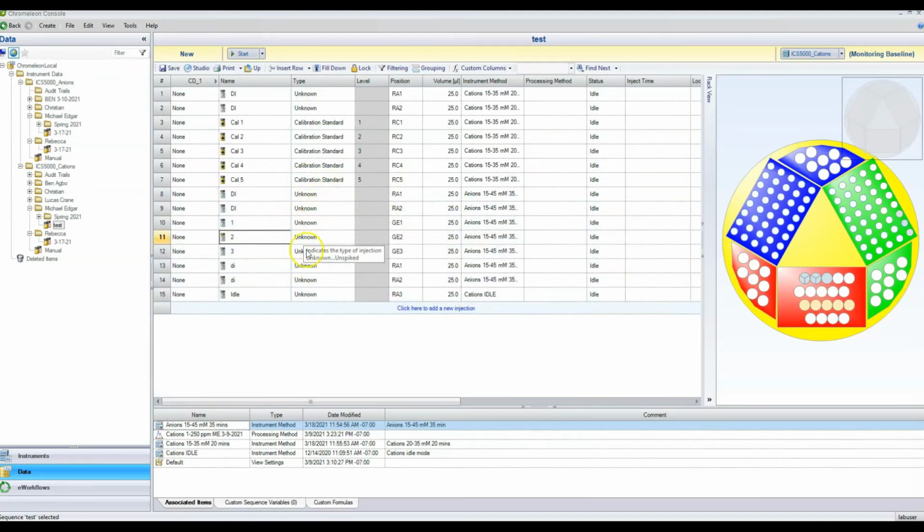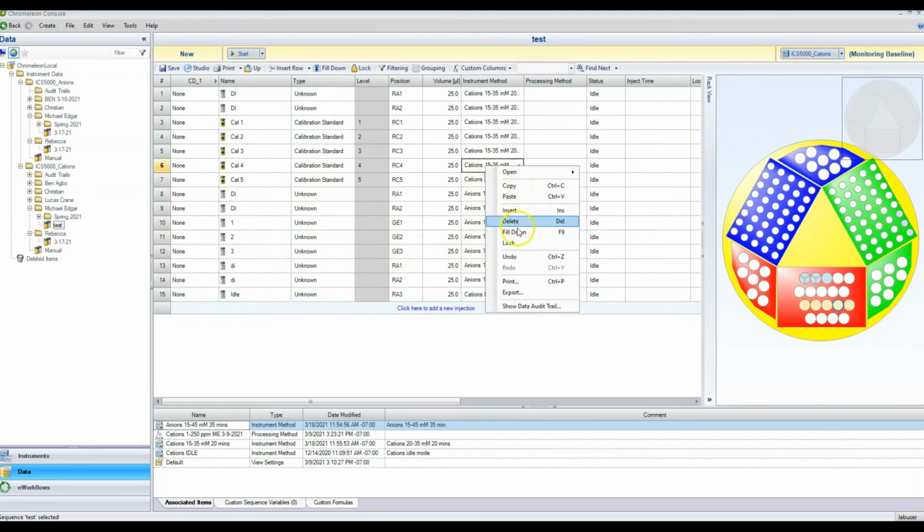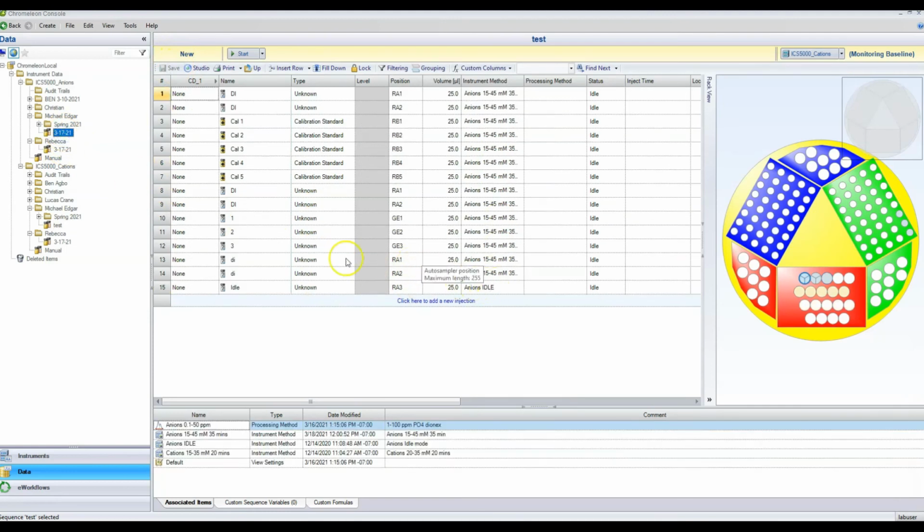So now it looks almost exactly the same, and this is so I don't have to rename my samples or change the positions. However, it still says I want to run anions. Now it's on the cation system, but it still says I want to run anions. So I'm just going to fill down the cation instrument method. This will change your idle, and your idle does need to be on the idle mode, so keep that in mind. It should always be cations idle, and this one should always be anions idle. So now we have two runs, and they are completely ready to run.